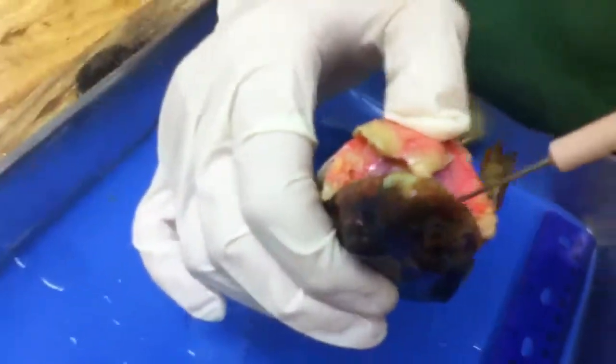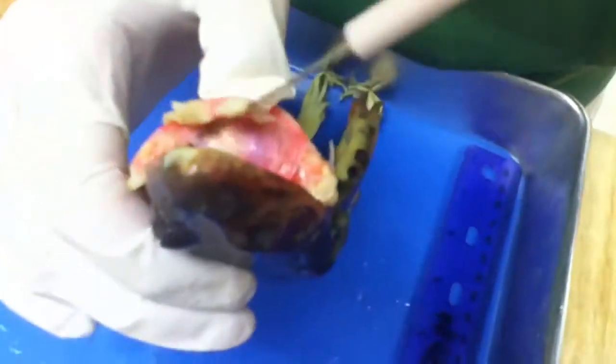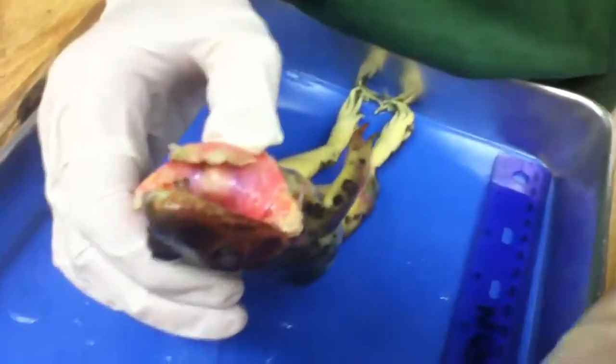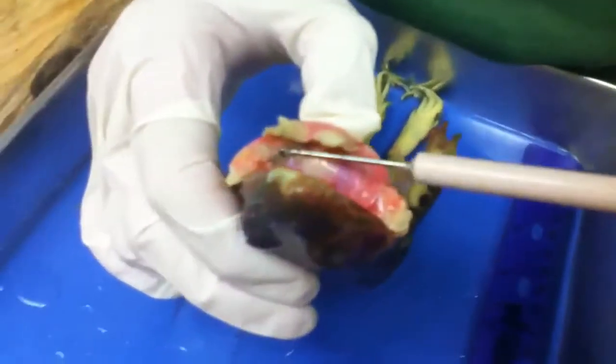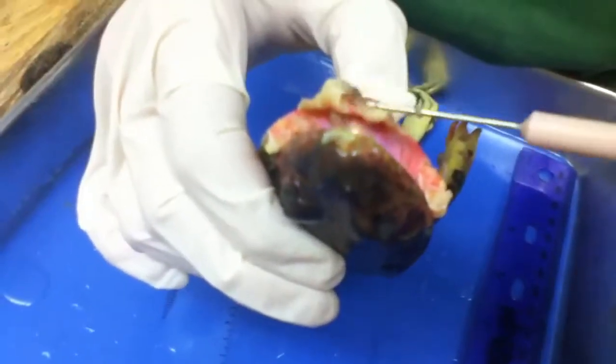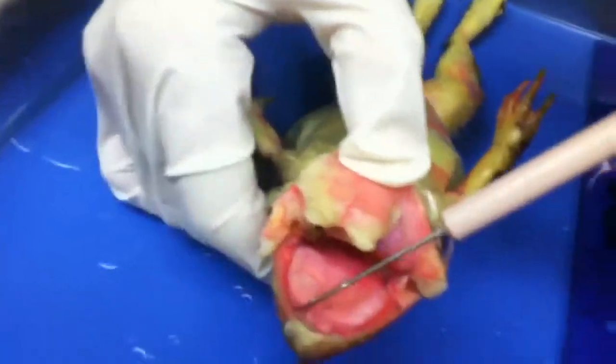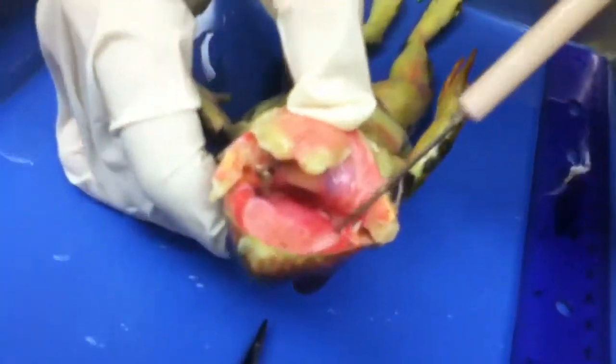Take your frog. Okay, you can see I just got my thumb down his mouth just a little bit. There's some stuff in his mouth. Take your scissors and cut, like I said, about a quarter inch down both sides of the mouth. Then I can split him open. Now I can see everything that's in here. Look at the tongue. You can see how far the tongue will come out. Some of your tongues will come out a lot farther, but that's what you're looking for.